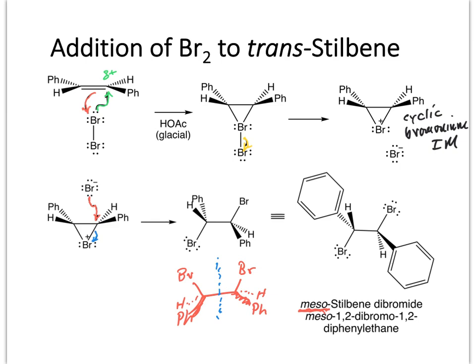That will be insoluble, we will filter it out, and then we will use that product for the second part of the reaction, the elimination of the two new leaving groups we've introduced to create the 2 pi bonds in the alkyne.